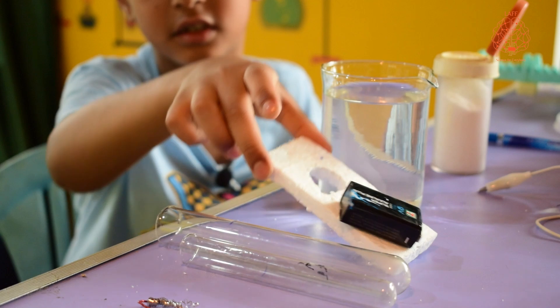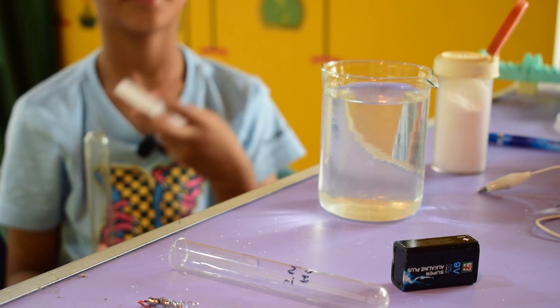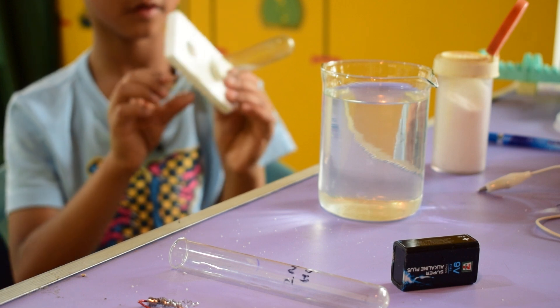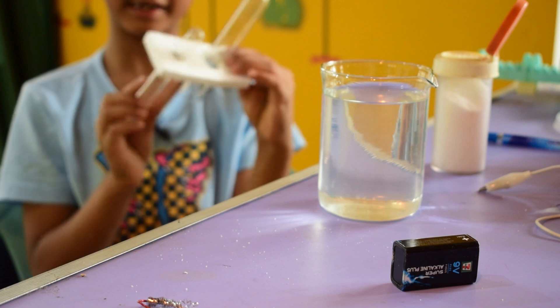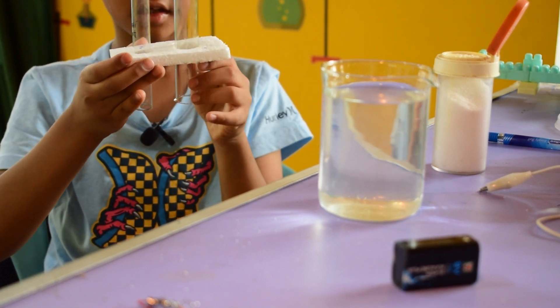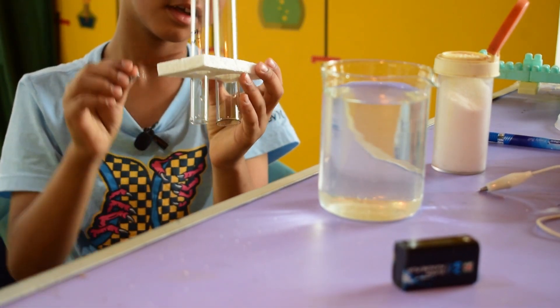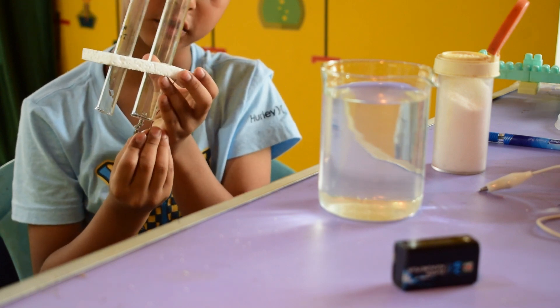Now we are going to take this styrofoam and put these two test tubes into it, because I have made holes here. I am going to put the next one inside as well. But first we will put the electrodes in here before installing everything.